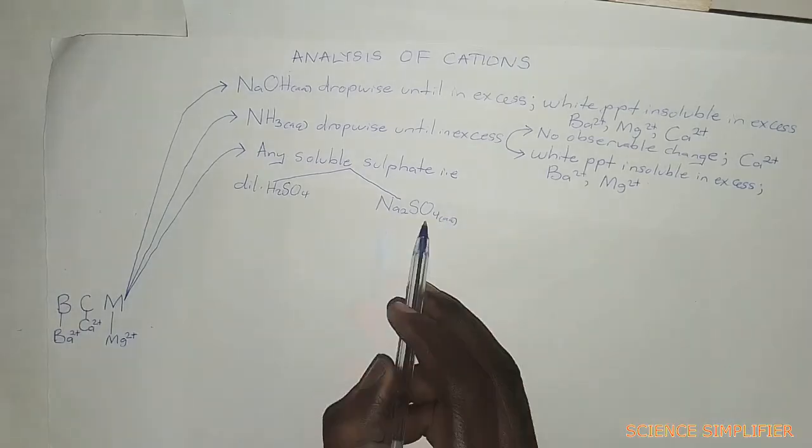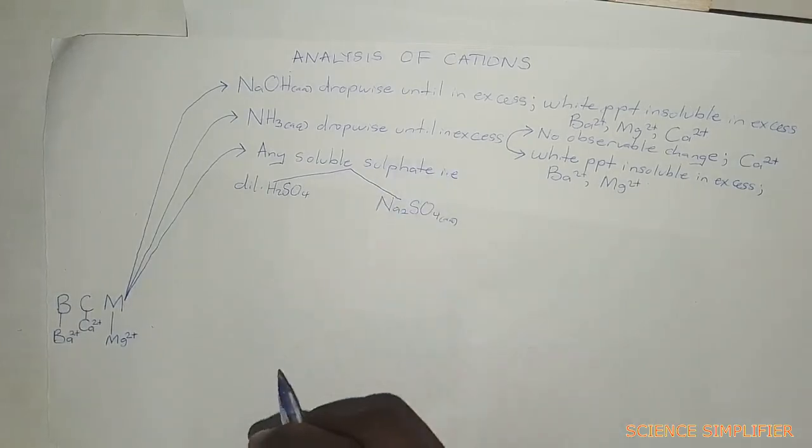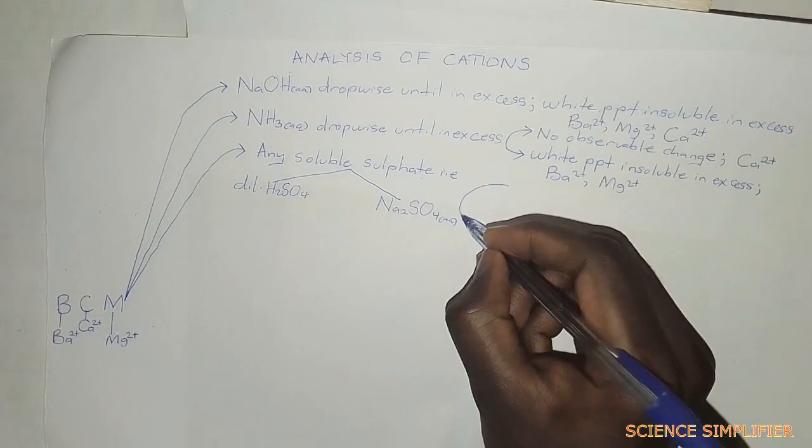Now for these, we just provide sulfate ions within the solution. Here we are going to have two observations.